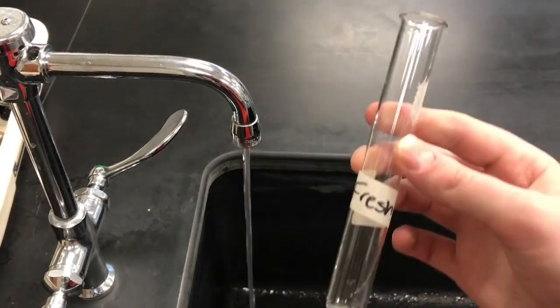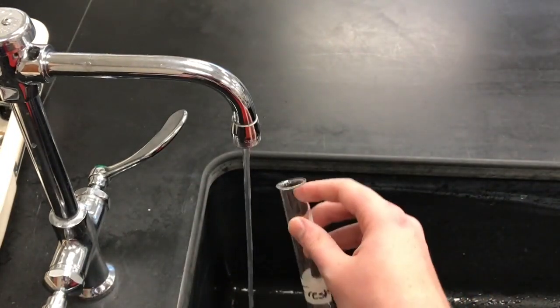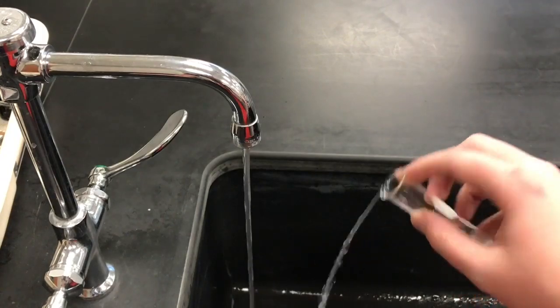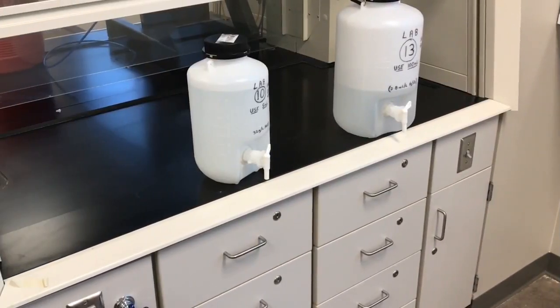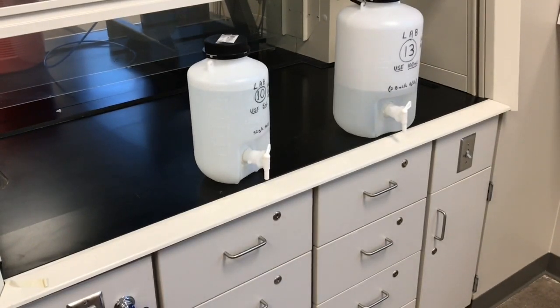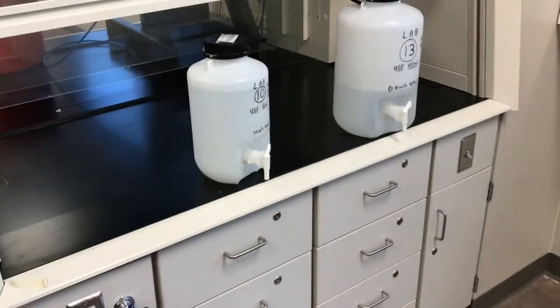For fresh water, all I'm going to do is fill up about a quarter of the test tube, like an inch and a half. Just fill it with cold tap water. That's actually probably enough right there. For the salt water test tube, I have salt water pre-prepared back in the fume hood. Again, you're going to want to get about an inch and a half, or about a quarter of the test tube, filled up.